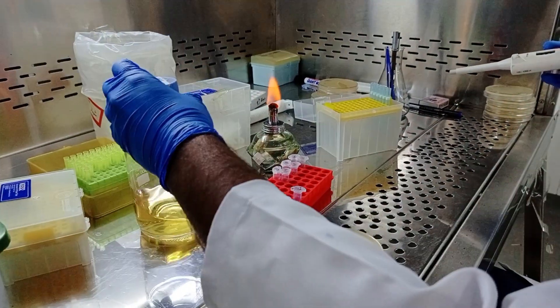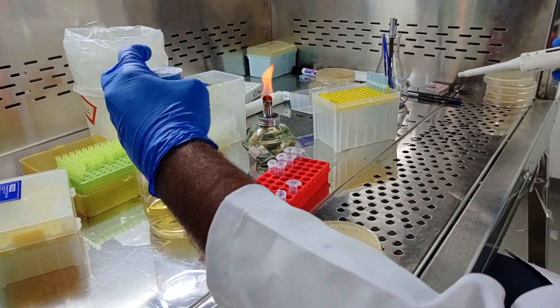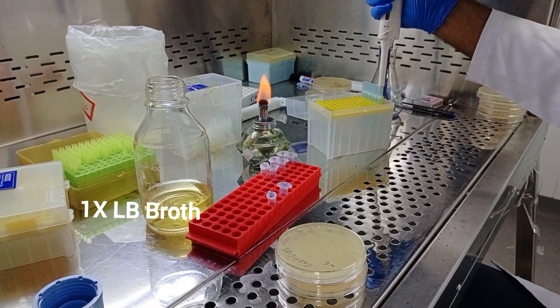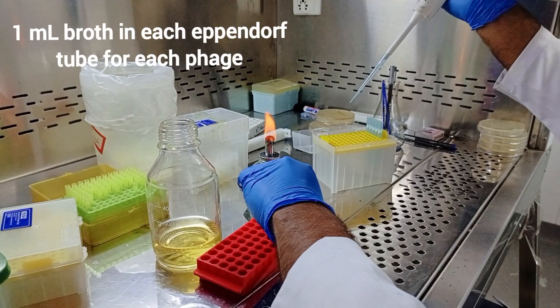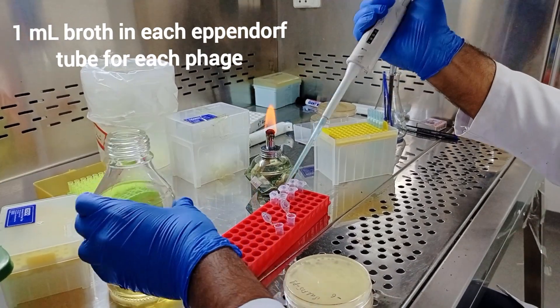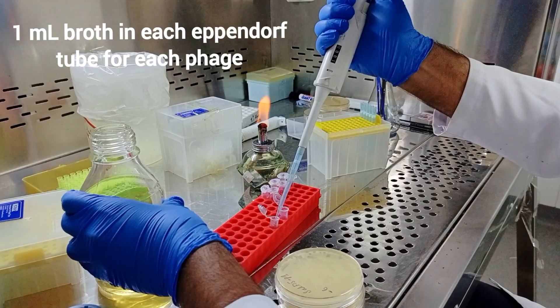So let's start the process. Take 1 ml eppendorf tubes — one eppendorf for one phage. Here we are purifying two phages, so we have two eppendorfs.